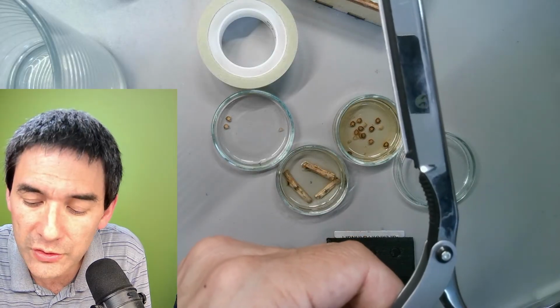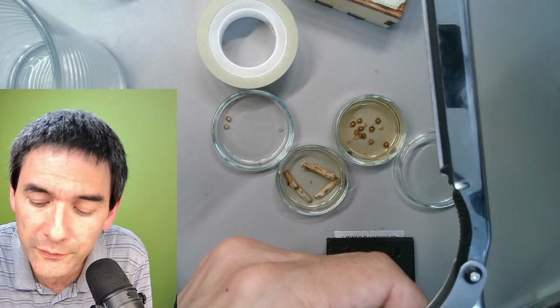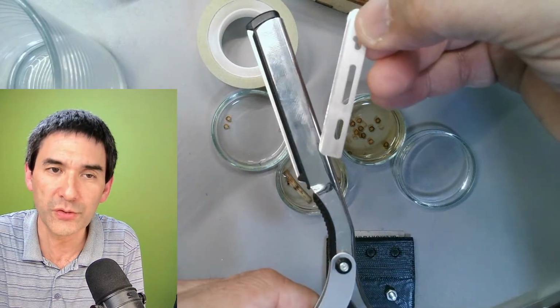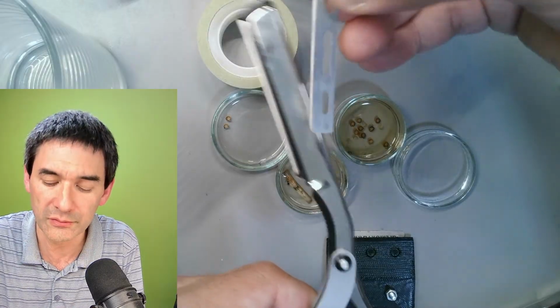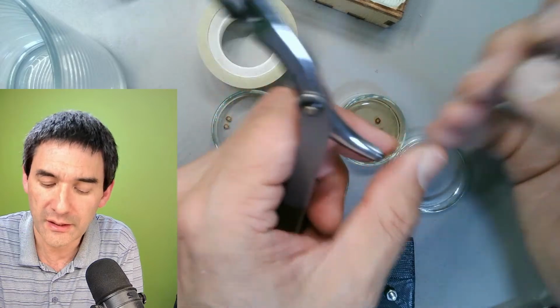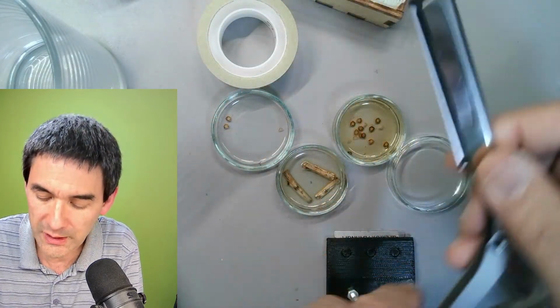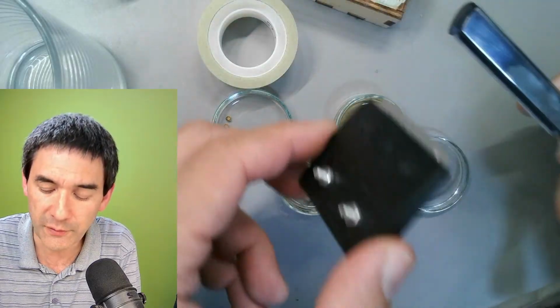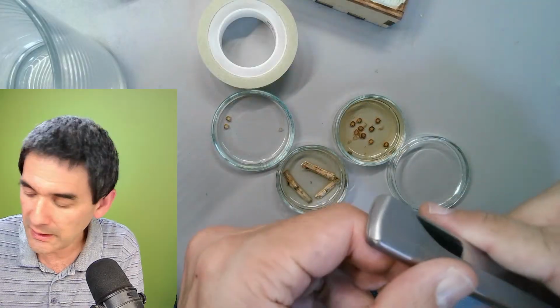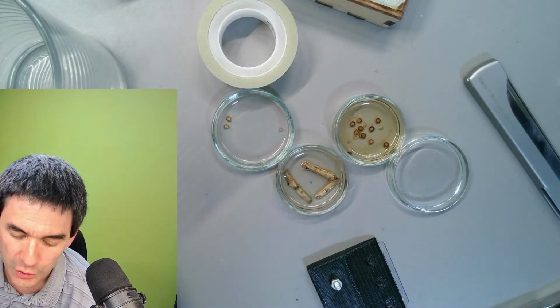Okay, those blades, they look like this. I mean, there are also different standards and systems here, but that's actually one of those blades that can go in here, right? This one here is also a bit flexible, right? But if you put it into the knife like this, it's fairly rigid, right? And you can use this knife, or I have been using this one over here to make those cuts here.